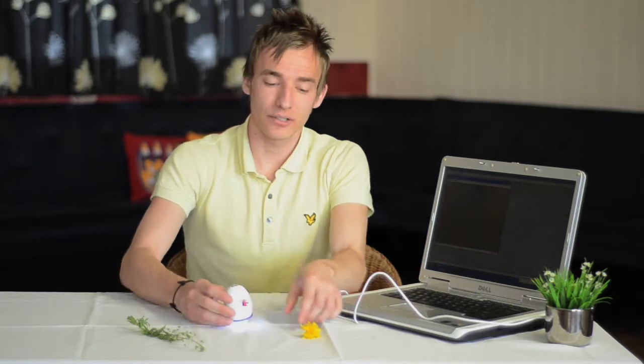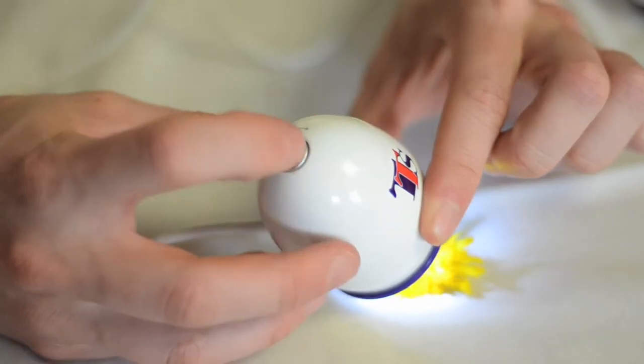A really simple and easy to use microscope, it comes with adaptable software where you can take pictures and video onto PC or Mac. Simply place onto any material such as plants, twist to focus, and press the button to take a picture.